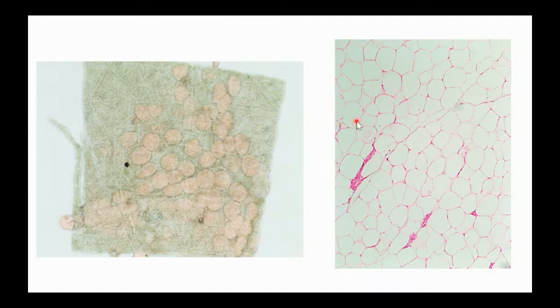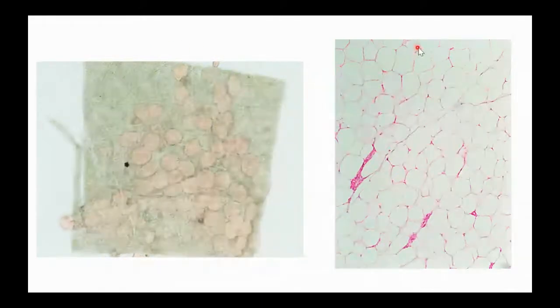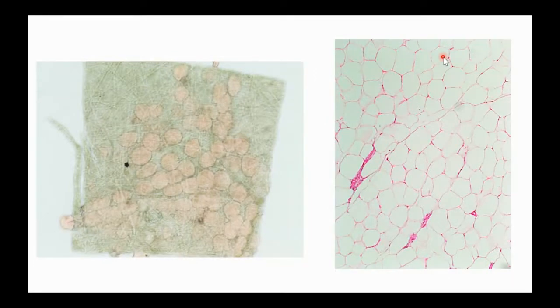So over here on the right, we see another example of adipose tissue where those lipids have been removed. They look empty on the inside. You can also see them though where those adipocytes look orange in color because we've actually dyed those lipids orange. So a couple of different ways that adipose tissue looks. Either we can see the lipids in the cells because they're stained, or those cells look empty like we see over here because those lipids came off.